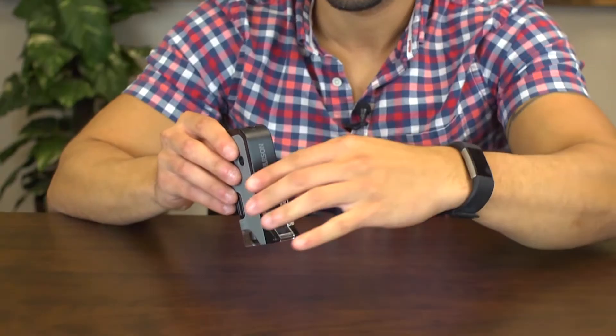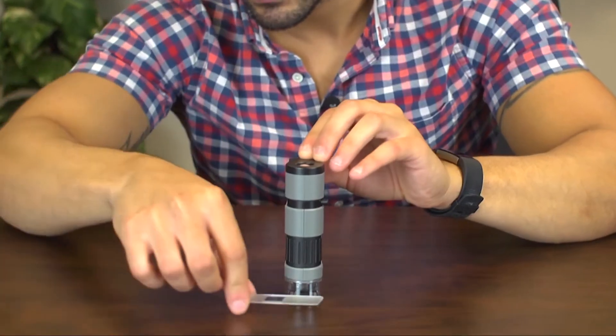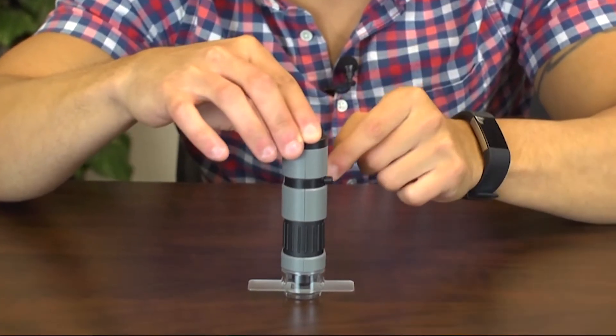It has some high quality optics, and on the side is a cool base plate that folds out so you can view different slides. Inside the kit you'll find a blank slide and cover slip to get you started.